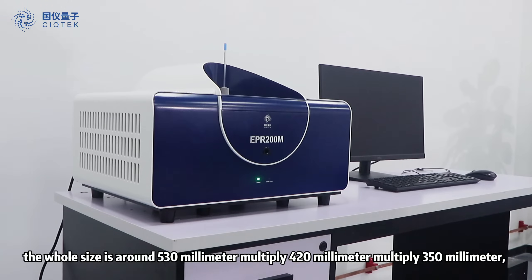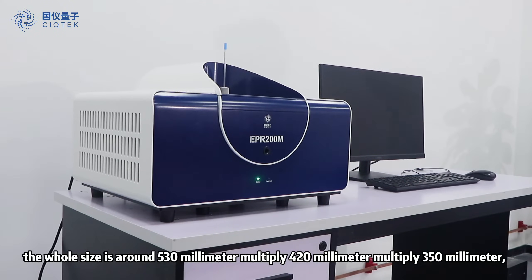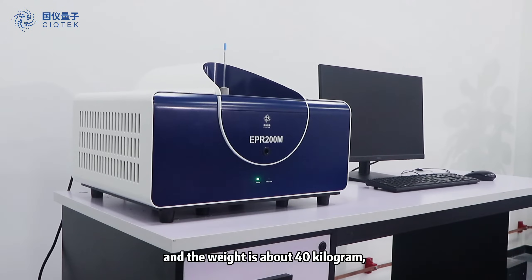The whole size is around 530mm x 420mm x 350mm, and the weight is about 40kg.